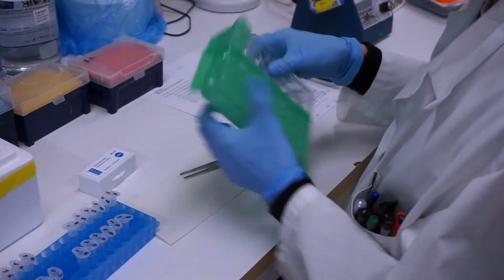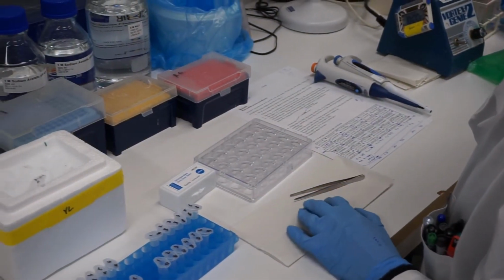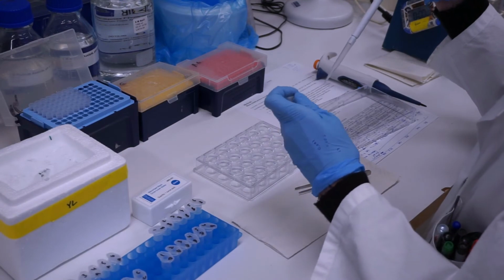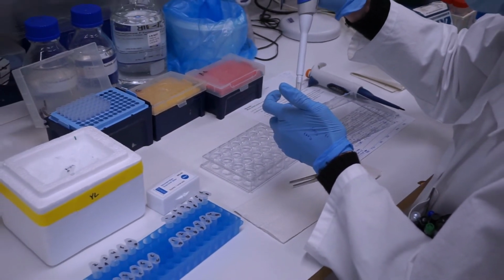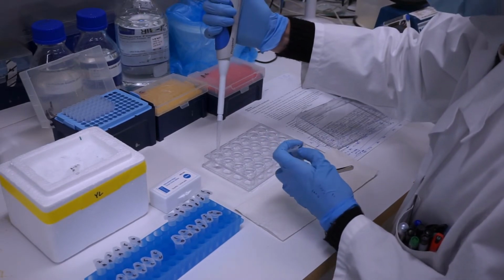Open the 24-well crystallization plate. Then, put 500 microliters of the prepared mother liquor solution into each well.